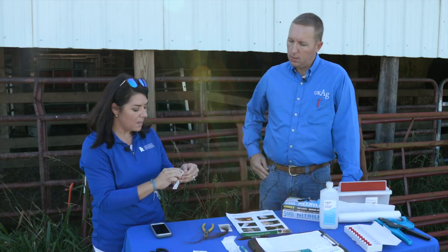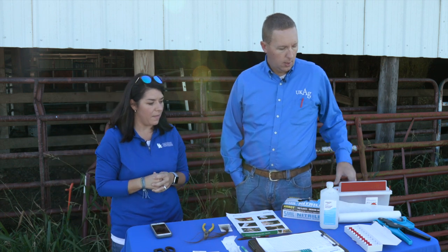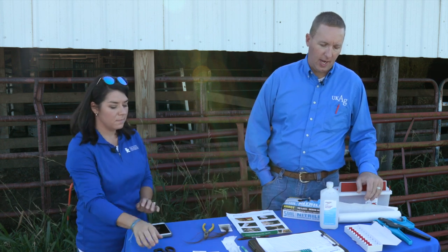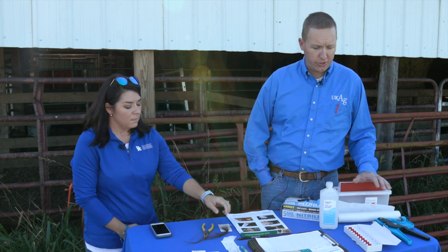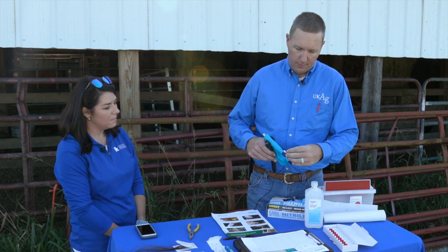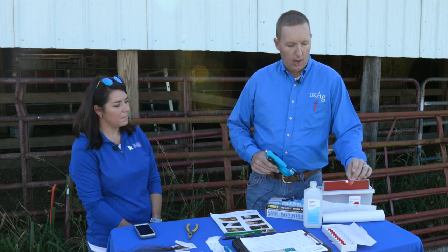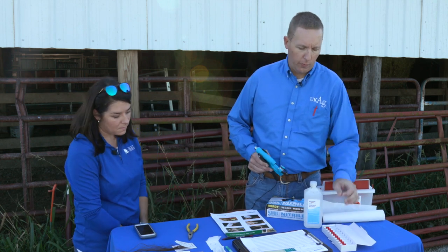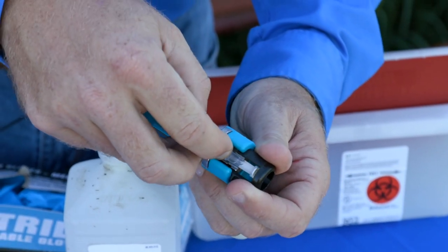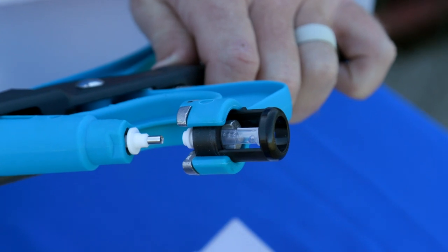The last option, and one that is quickly becoming the most popular — I think it's the easiest and we get the best sample out of it — is called a TSU. A TSU uses this little collector and a gun, and it essentially takes a tissue sample from the ear of the cow. It is clean, it's easy, and all of these are barcoded so that they're easily identified per cow. It is slightly more expensive right now, but as technology progresses I would suspect it probably does get cheaper the more people that do it.